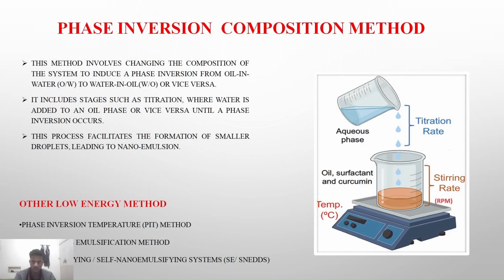And under the low energy method, we have used the phase inversion composition method. So what is the phase inversion composition method? This method involves changing the composition of the system to induce a phase inversion from oil in water to water in oil.